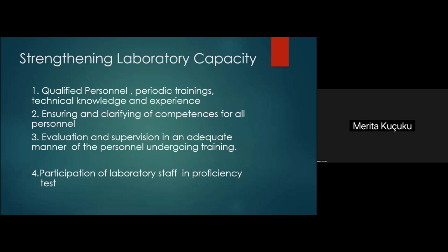Everybody in the laboratory should be very clear about what their responsibility is, what the competencies are, and what they should do in this laboratory for quality control of medicine. There should be evaluation and supervision in an adequate manner of the personnel undergoing training, and participation of laboratory staff in proficiency tests.